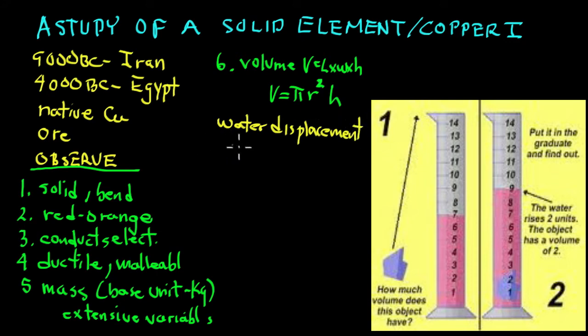What we do is, you'll see the example over here. We get a graduated cylinder, number one. Pour water in it. We get the initial volume of the water. The initial volume.